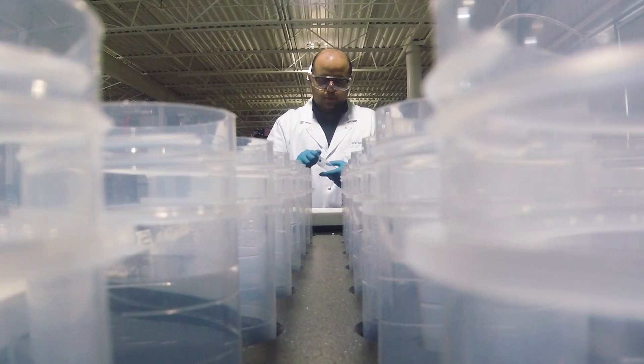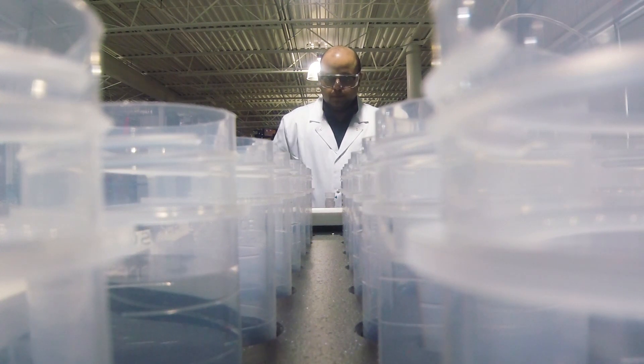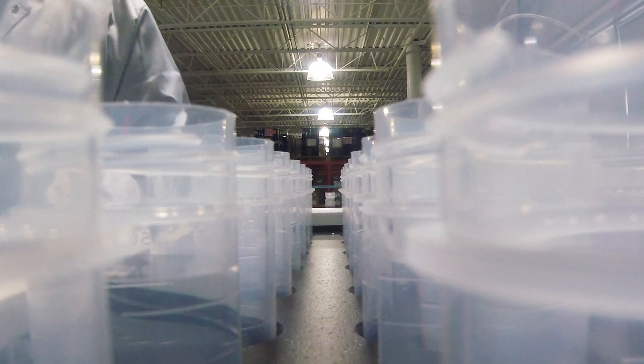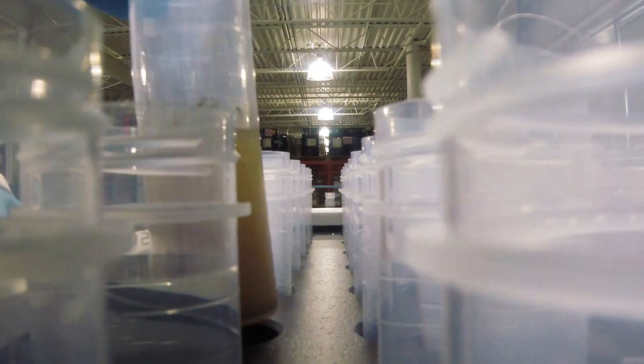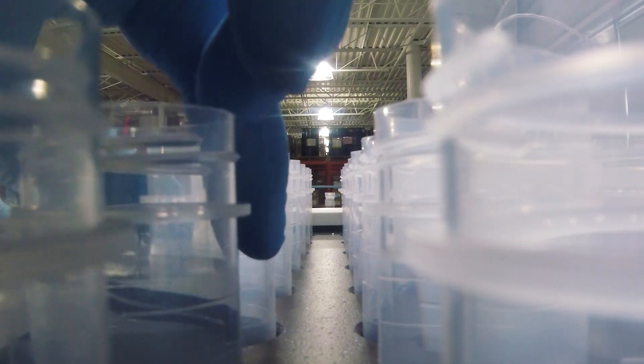DigiFilters aid with sample preparation. The vacuum assisted DigiFilter assembly provides a quick and easy way to filter samples prior to analysis. DigiFilters increase lab productivity by filtering particulates from digested samples in a matter of seconds.